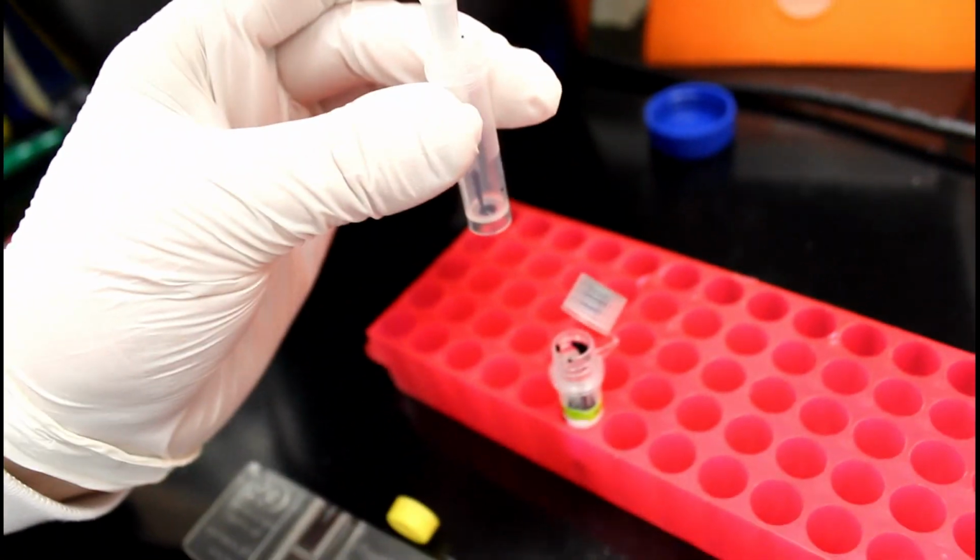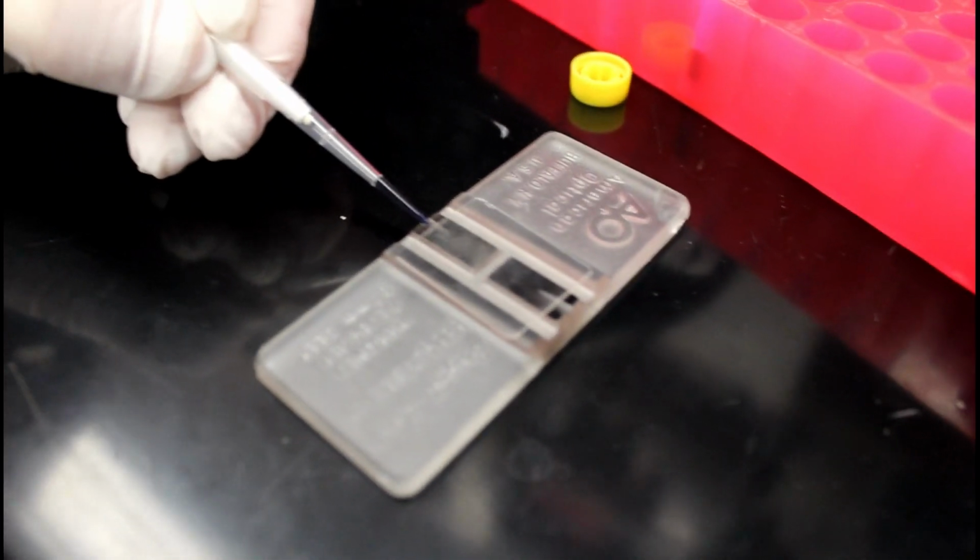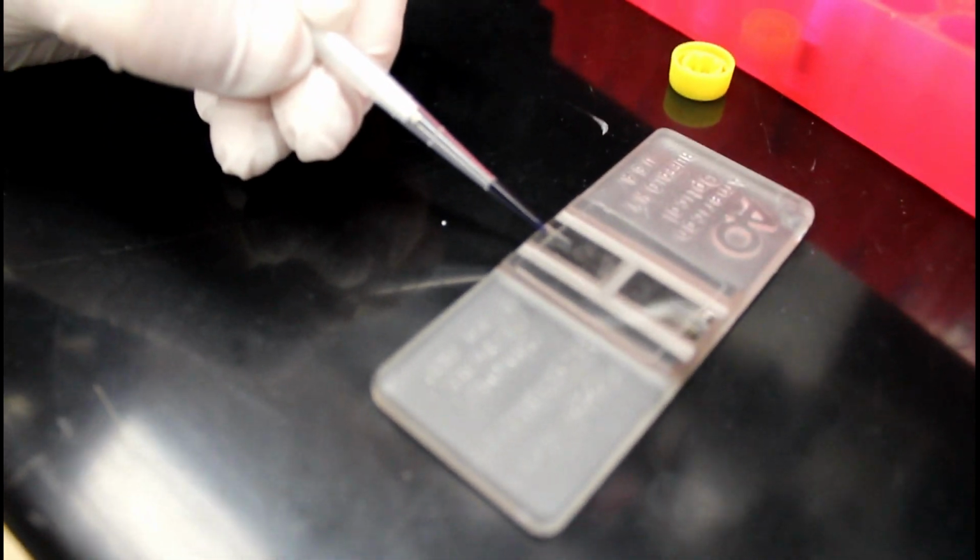Mix that up and down several times. Next, on the hemocytometer, take 10 microliters of the sample, inject it into one of the ports so that it's adequately saturated.